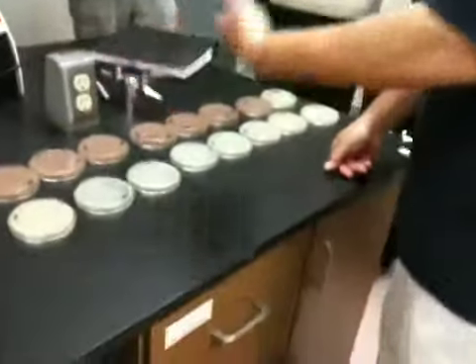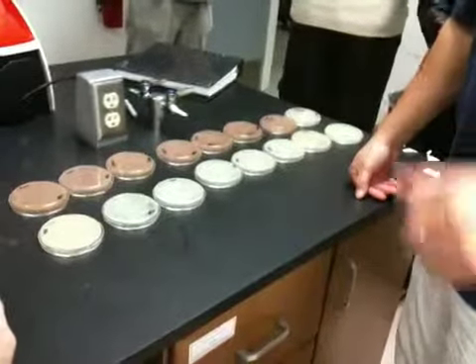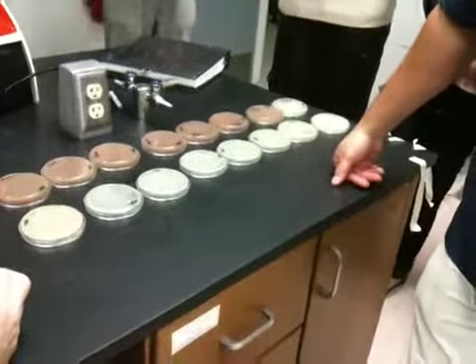So I'm going to leave this here for endospores, you guys to look at when you have an opportunity. Yep, endospores can survive, because the UV won't kill it. It's going to protect it.